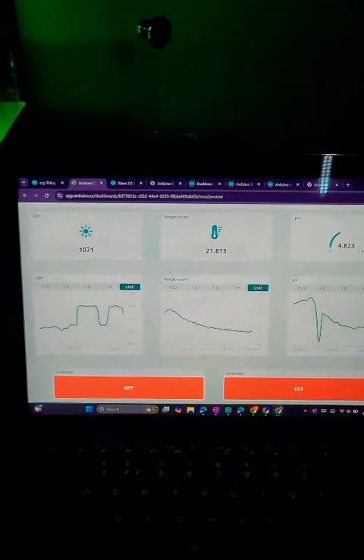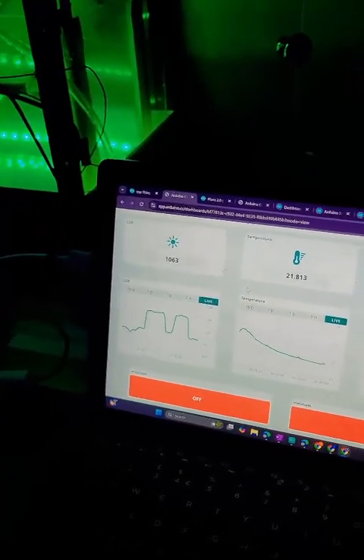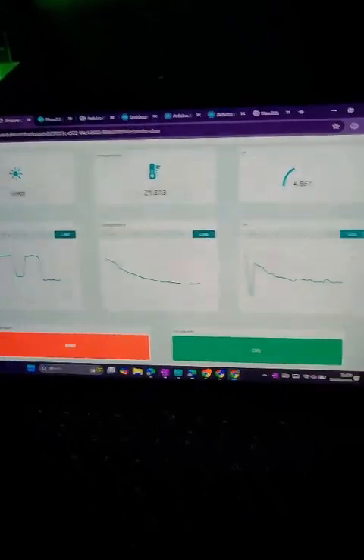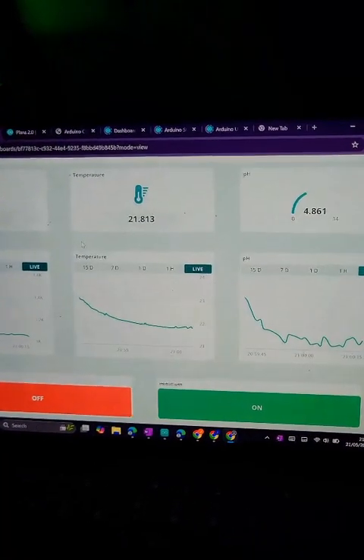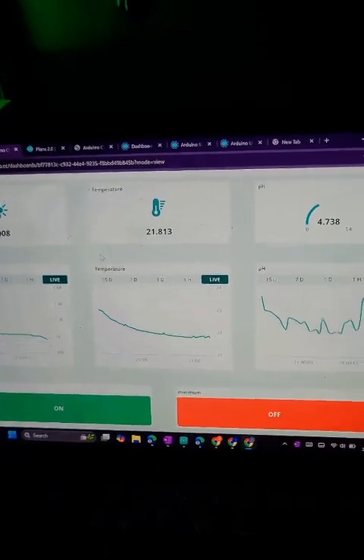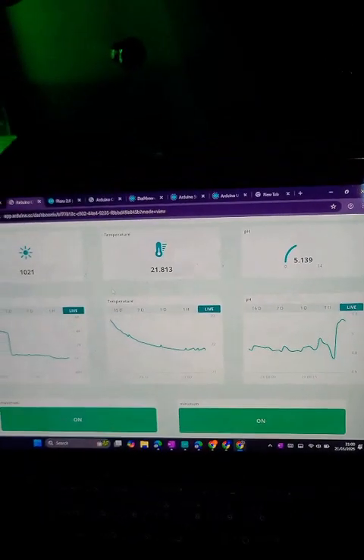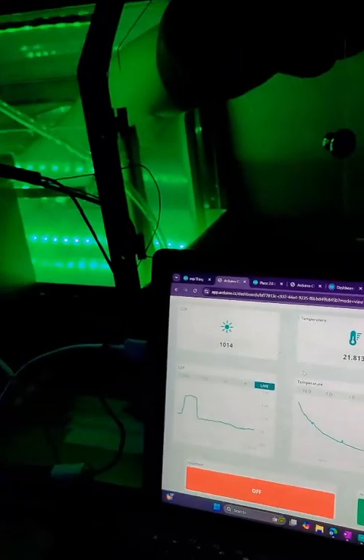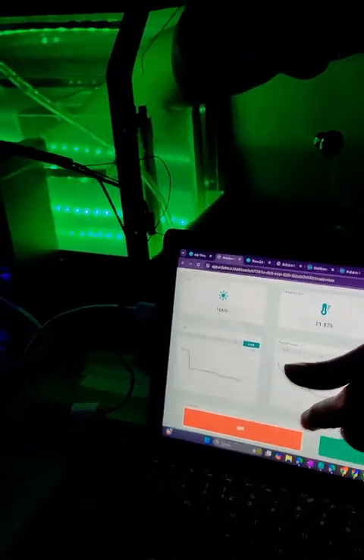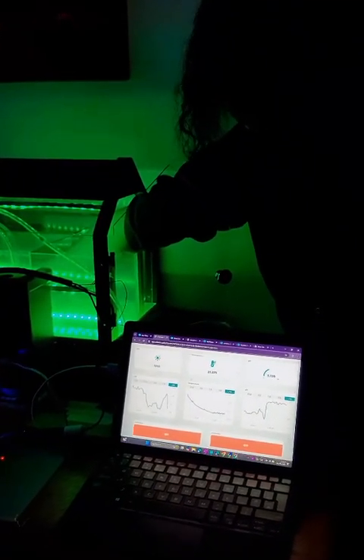Also, by the way, if I push the minimum, we push it up and pretend that there's water, because this sensor floats. So now the low is green. But if the water goes all the way up, they both should go up because the water is touching both of them. But let's say we drain the system, it's not the maximum anymore. So the maximum turns off, and that's now at the minimum, right? But if the water goes down, it should turn off. That means it is at the minimum.